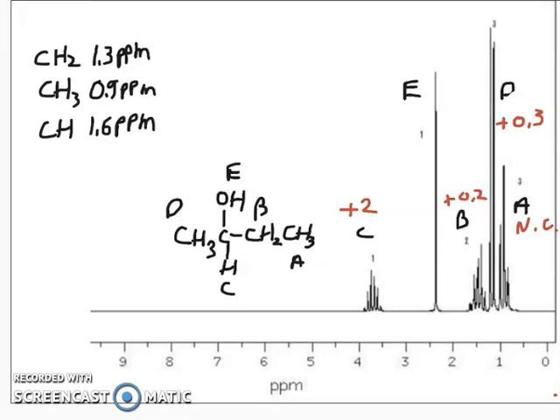Having a group distant from a polar functional group like OH, this CH3, for instance, will have minimal effect. As we get closer, so going from the CH3 down the end to the CH2, that's one carbon away, we get a more significant effect. And when the group is directly attached, like the CH labeled C, we're going to have our most dramatic effect.